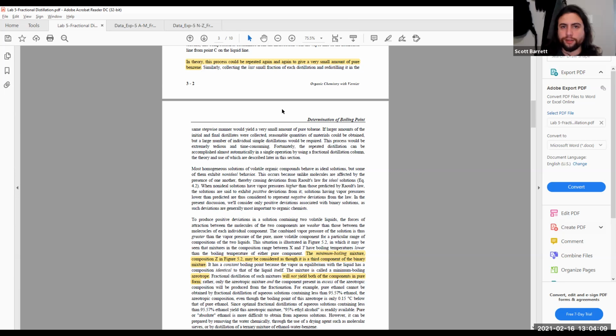If you wanted to actually isolate benzene, you'd have to continue to take what you've boiled off, which has a mixture of benzene and toluene, and continually do that until you only had benzene. In this system, you'd be left with toluene in the main boiling flask, and it would just continue to rid of the benzene.